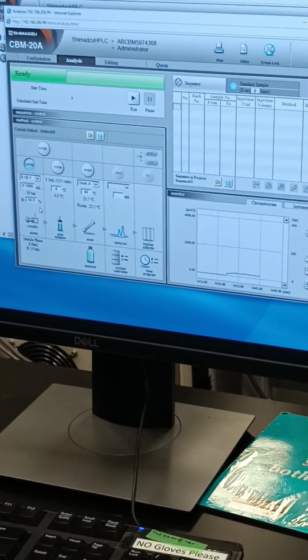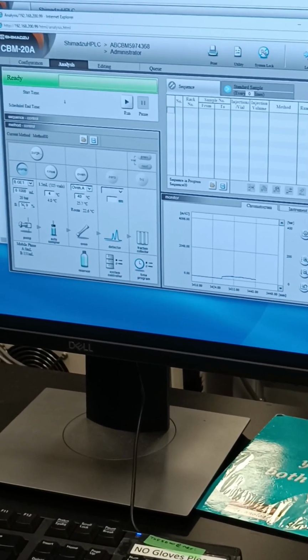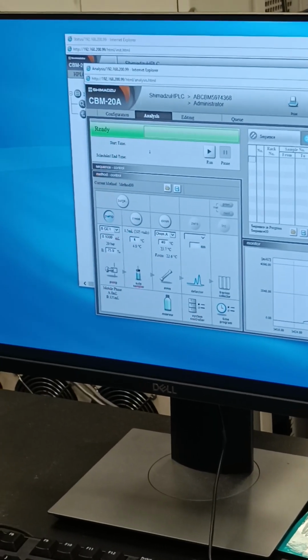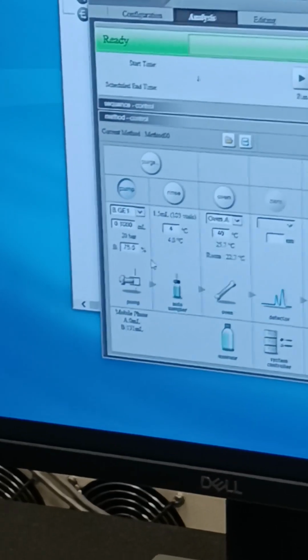The column. So now you notice, it's back to 20. It drops a little bit. Expected. Okay, and then I just change it to 75. And here I think it will drop until like 13 bar.